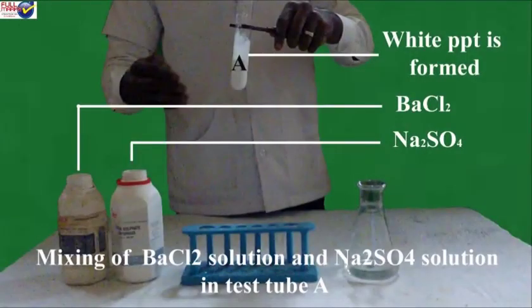5. Take a solution of sodium sulfate and barium chloride and mix them. A white precipitate is formed on keeping the test tube on the stand for some time. 2 layers of barium sulfate with colorless sodium chloride are obtained.